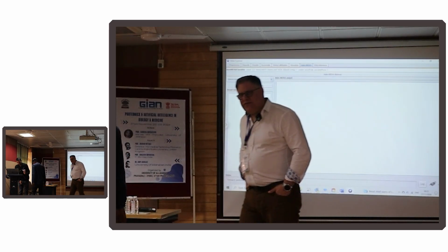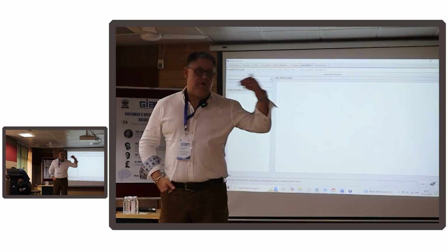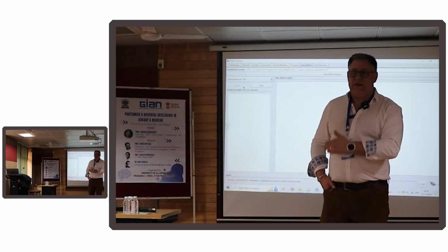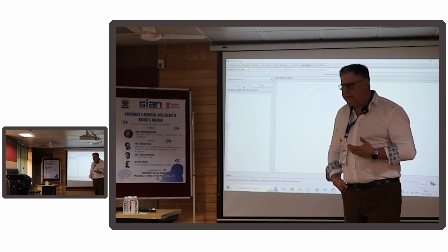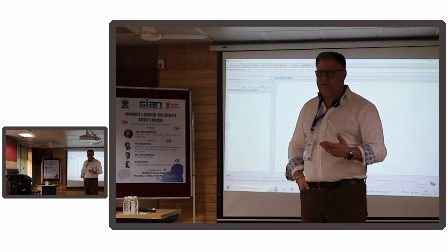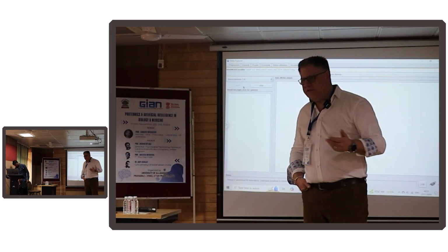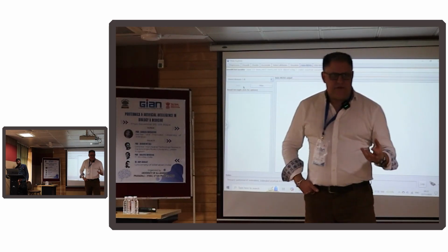So this is a good time to actually run it while they're fixing the microphone. This will just keep running. It tries lots of algorithms, lots of parameters, and it will find the best solution for this data set. And sometimes that's all you need to do. You've got a data set, you want to find the best method to use, and maybe then you can use that as a basis for further data sets that you evaluate. So that's helpful.